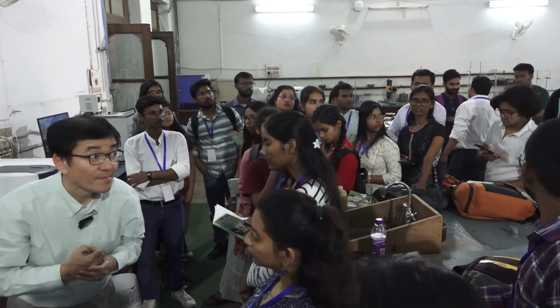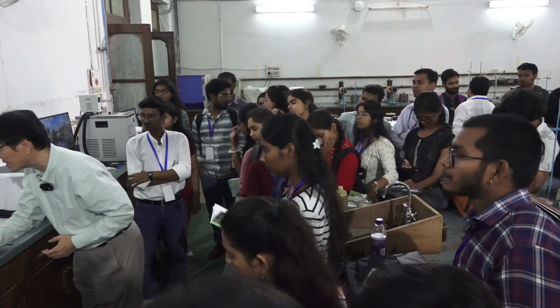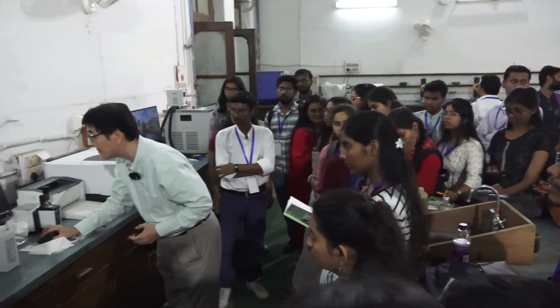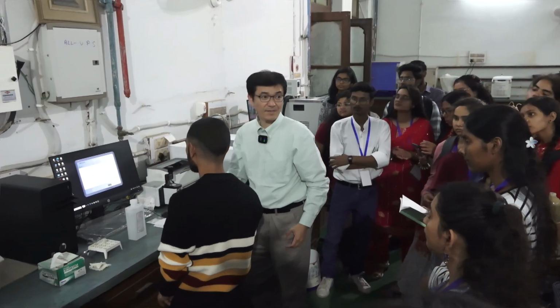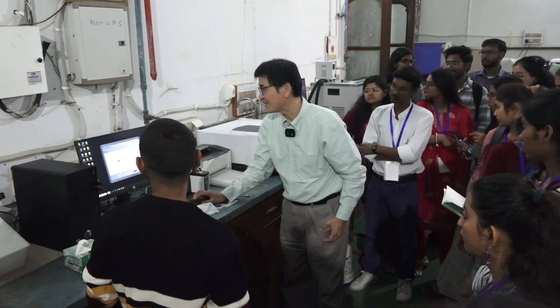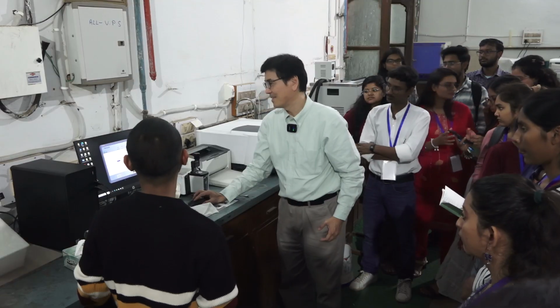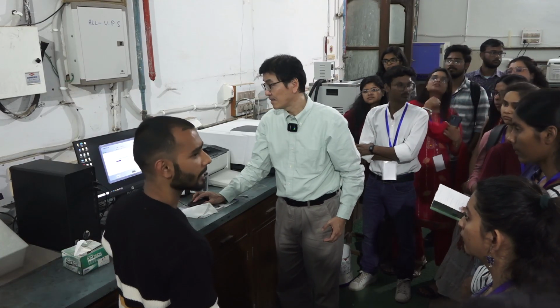Software. Next. Now collecting background. Just a moment, the measurement is going on. This is the first one, the background collecting point.